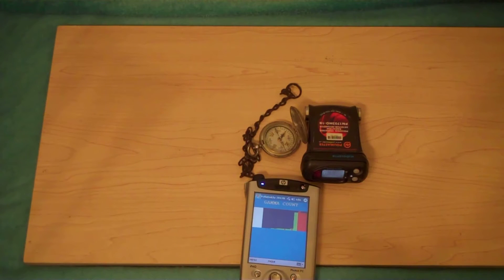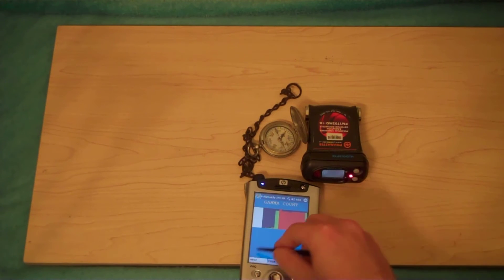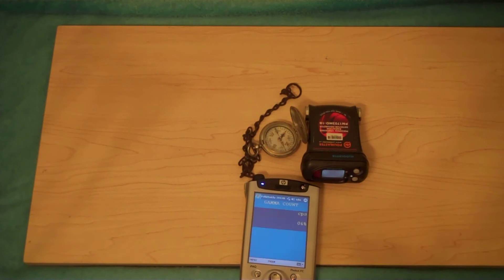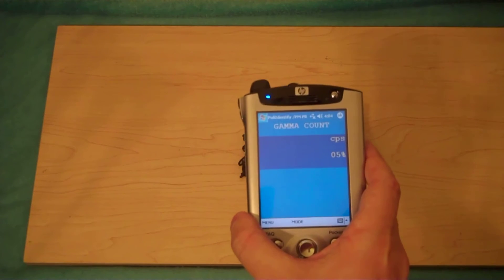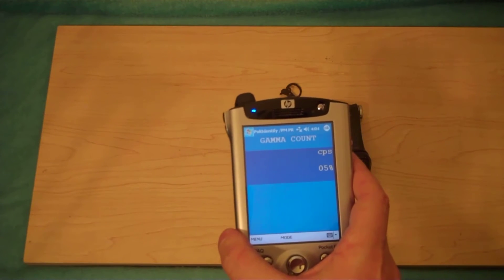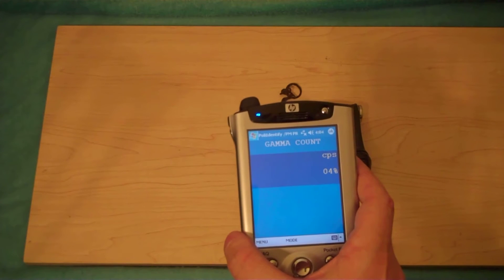I personally prefer seeing the numbers, but you can do this either way. By the way, the red is signifying an alarm, which is important. Switching back, you can actually see the counts per second from the actual compass — 81 counts per second. Not bad at all. And we are now 96% accurate.